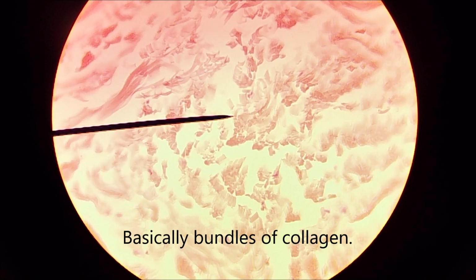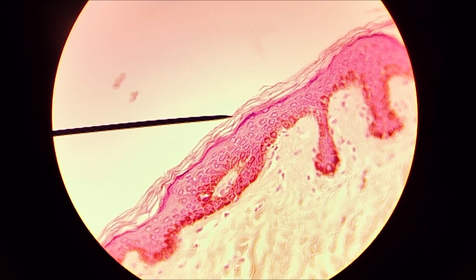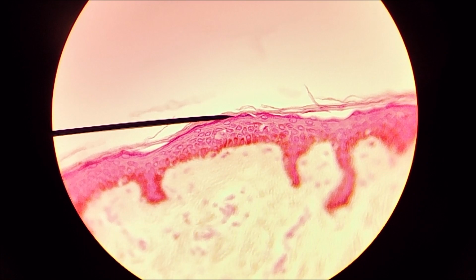let's see here. There is stratified squamous epithelium. So this is the skin, stratified squamous in the skin. Let's see if we can find a nice spot. Yeah, there we go. This is stratified squamous in the skin, and you can see the flaky layer at the top, which makes this keratinized stratified squamous.